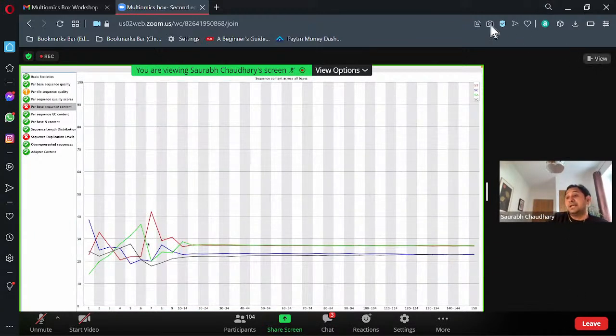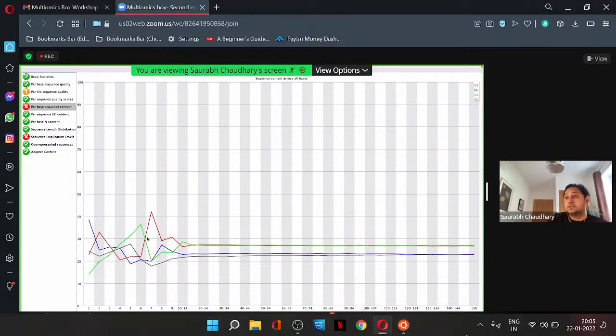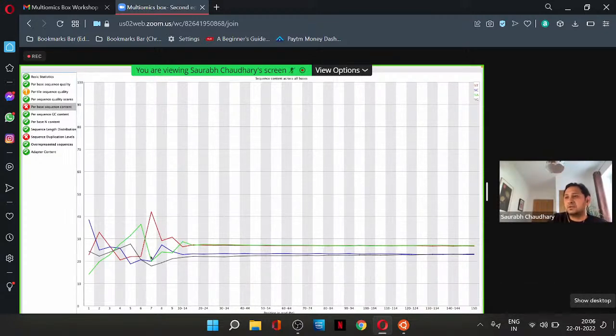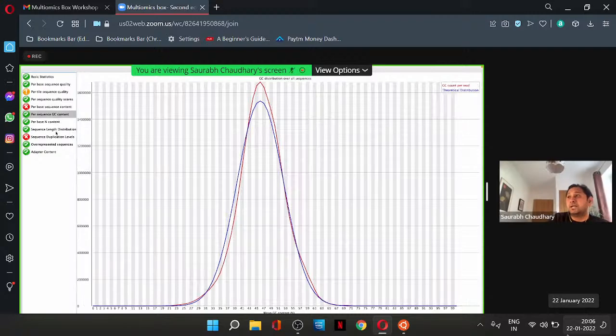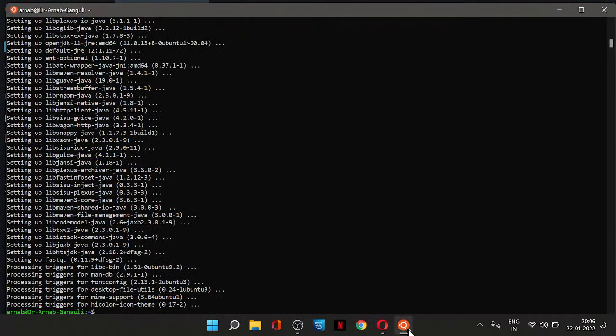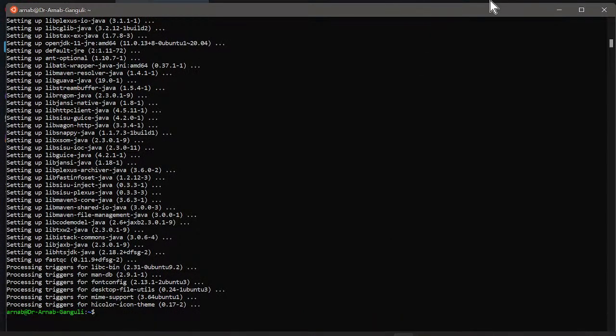Per base sequence content is quite different because these are different, like A, T, G, C with different colors. So it's not good here, meaning your GC content is either less than 40% or something. It might be the problem of adapters because you are attaching the adapters. After removing adapters and trimming, it will get fine, and your sequence will be fine for analysis. But per sequence GC content is perfect here, perfect green, nearly 50%, which is perfectly fine.